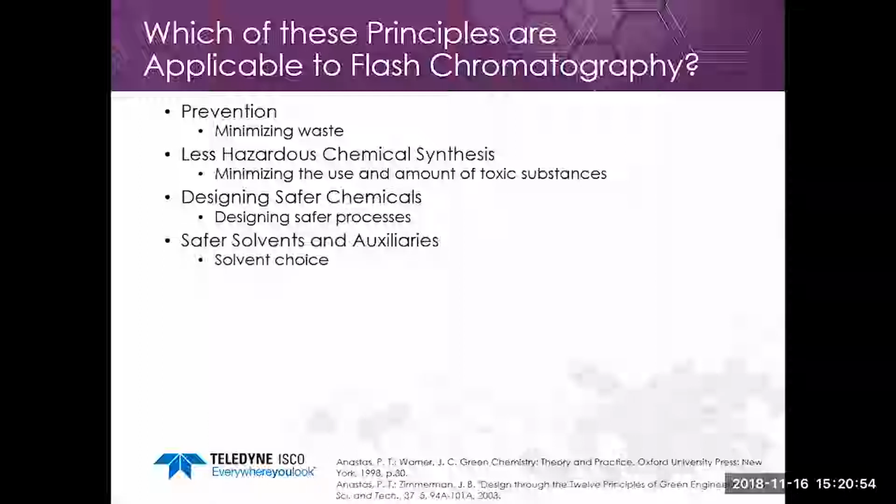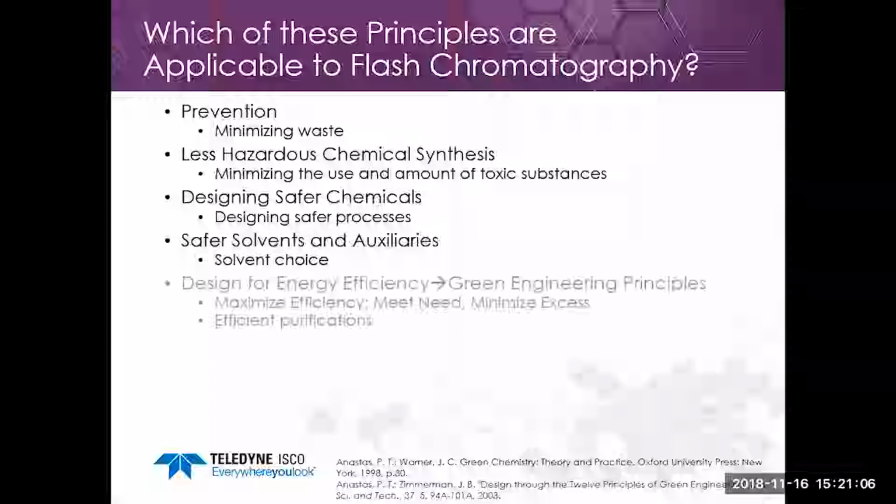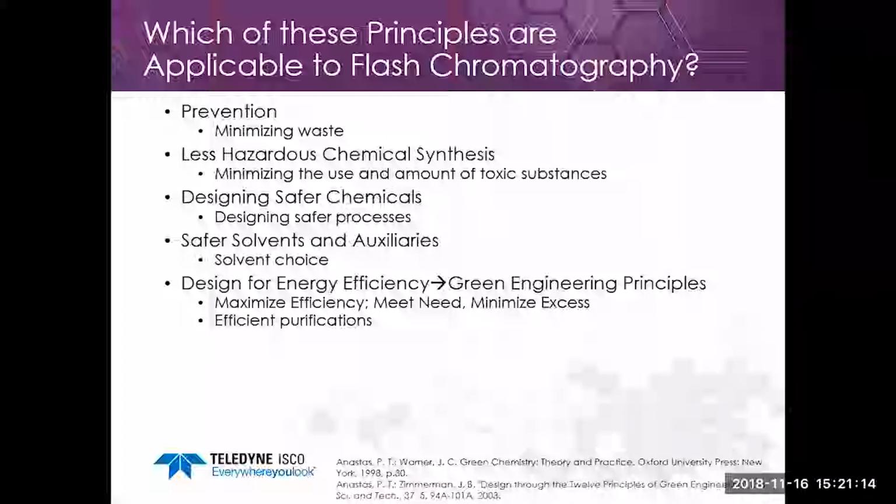Safer solvents and auxiliaries. So solvent choice plays a huge role. So if we can develop alternative solvents that are more benign and still useful to us, and we can substitute those in, we'll discuss that. Another principle, designing for energy efficiency, and this actually also corresponds with a green engineering principle that I think applies to chromatography in a big way, and I think it's a good idea to remember, and it's maximizing efficiency.